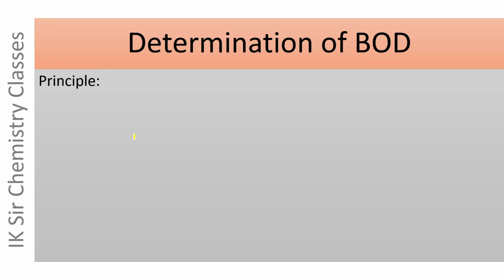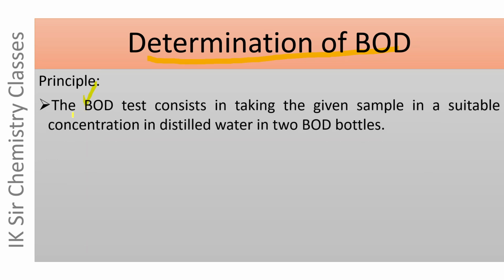Now, the main portion of this video is determination of BOD. Let us see the principle of this process. The BOD test.